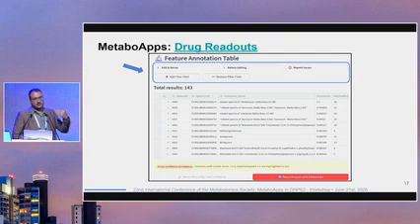Those are considered analogs. If you really want to go into detail, you can open up the spectra in the library and see what exactly you have for any type of drug. You're going to see some differences in the structure that are really similar to the parent drugs, and the list is really long.